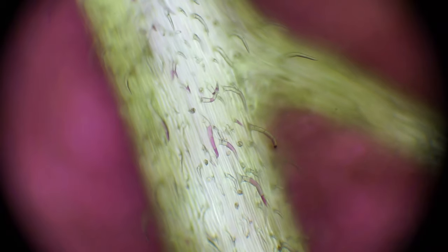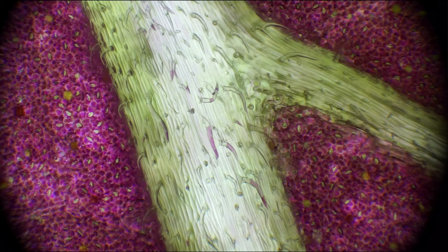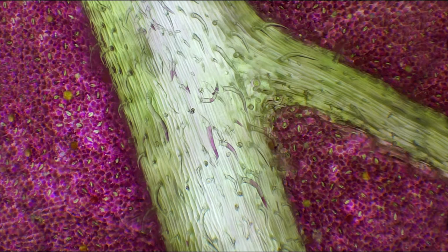Finally I will just focus over this vein and I will try to focus stack this piece of video. It has 400 frames. I stacked it in Helicon Focus 7 to get the final result like this. I quickly edited it in GIMP and removed the vignette in the corners.